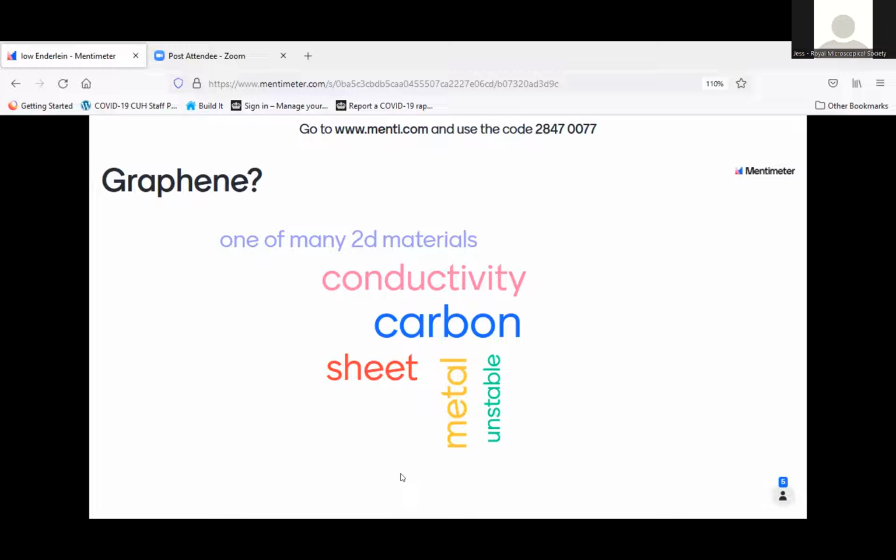We have simply to publish them. I can simply tell you it works. We use graphene-induced energy transfer for measuring diffusion in a leaflet specific manner, and it works very nicely.